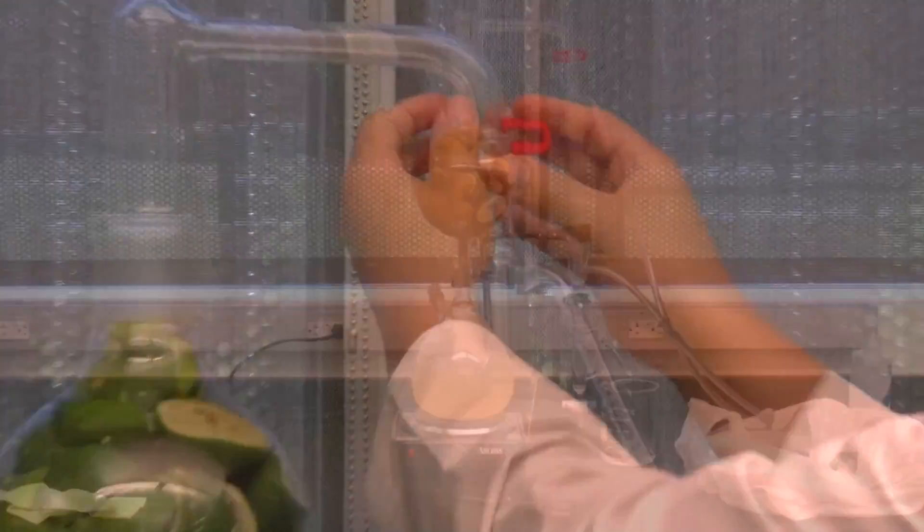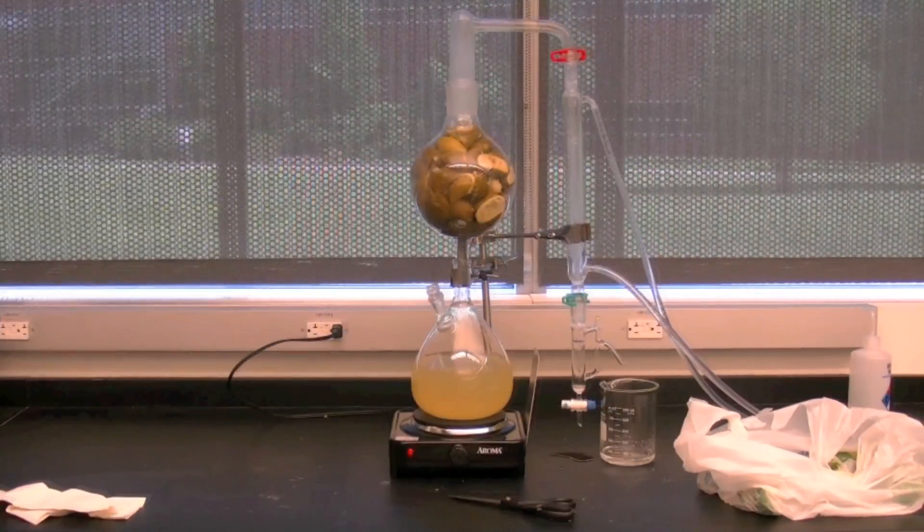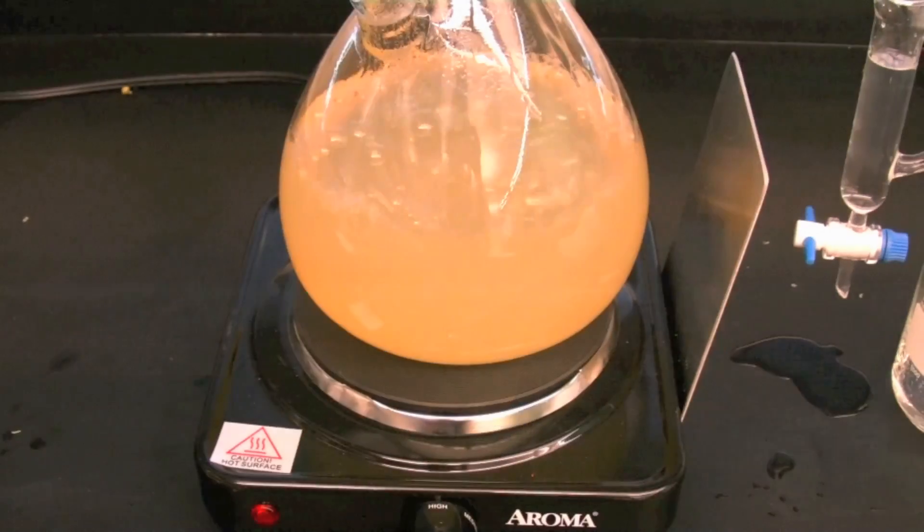Turn on the cold water such that there is a gentle flow of water through the condenser. Plug in the hot plate and turn the temperature to hot.